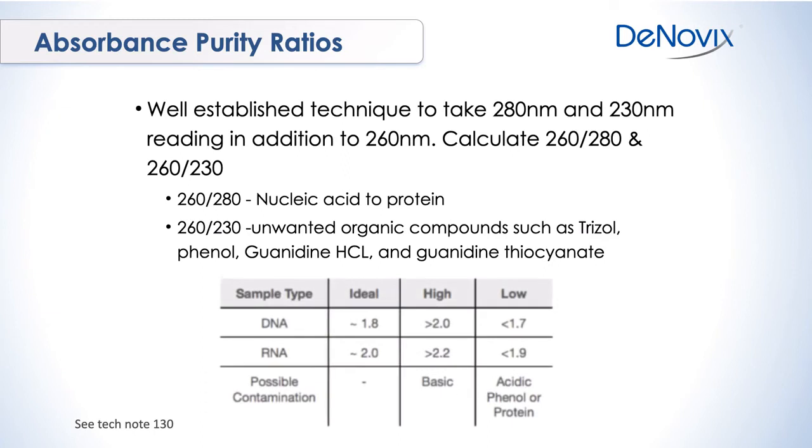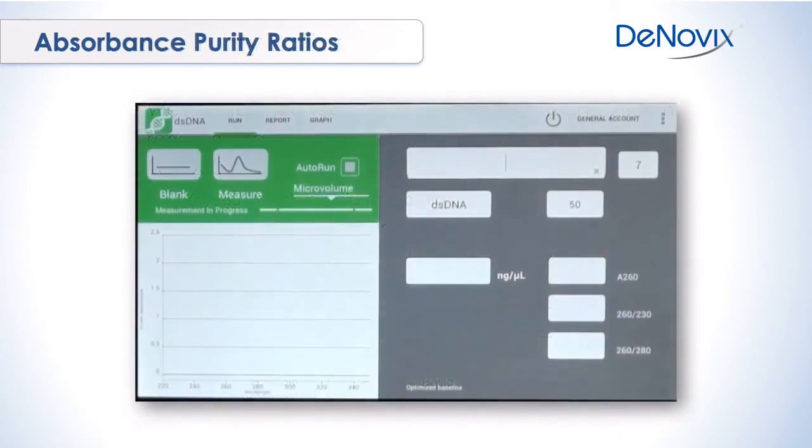And there are a set of well-established thresholds where samples are deemed either good or bad, whether they're inside or outside of these thresholds. And just to give you an idea of how this looks in practice, I took another measurement sample here.